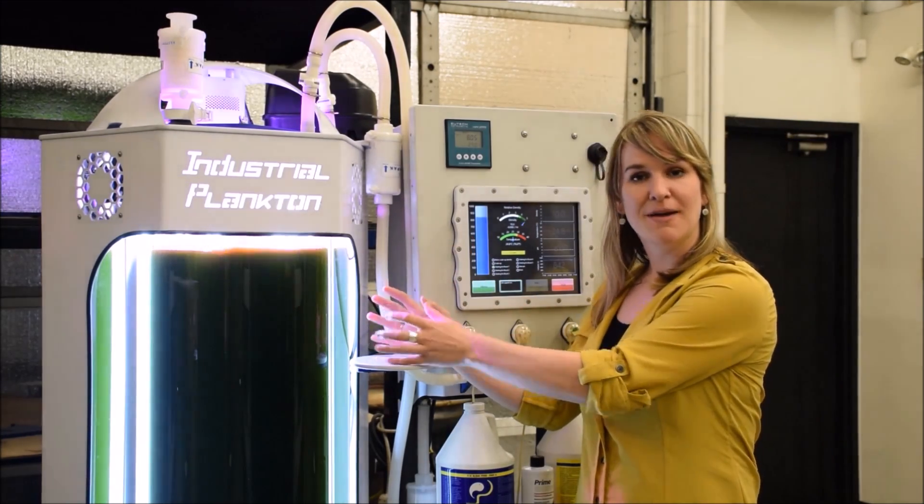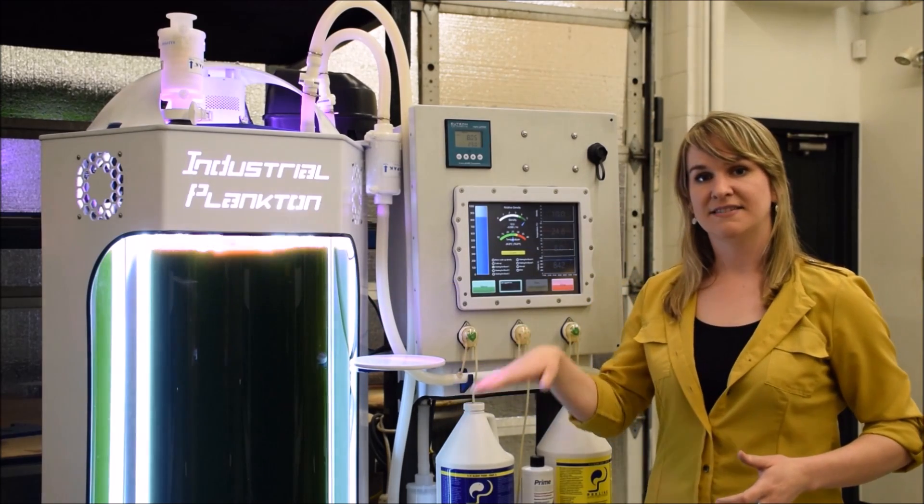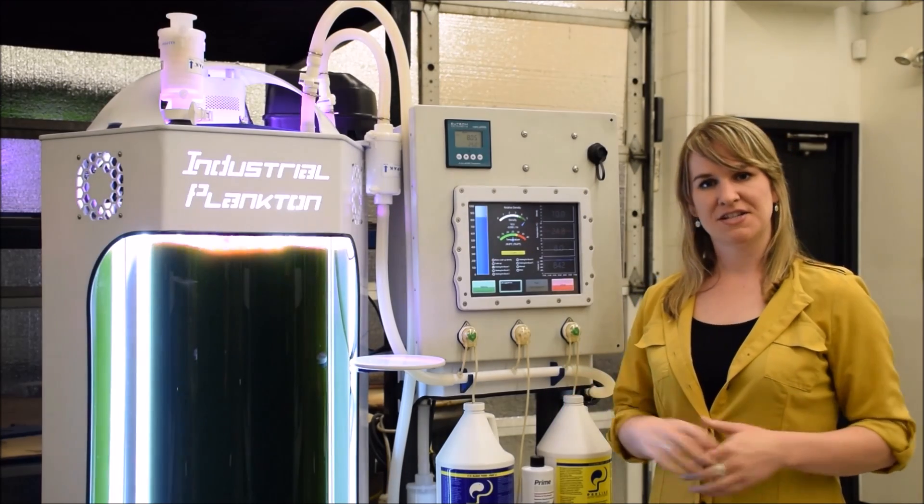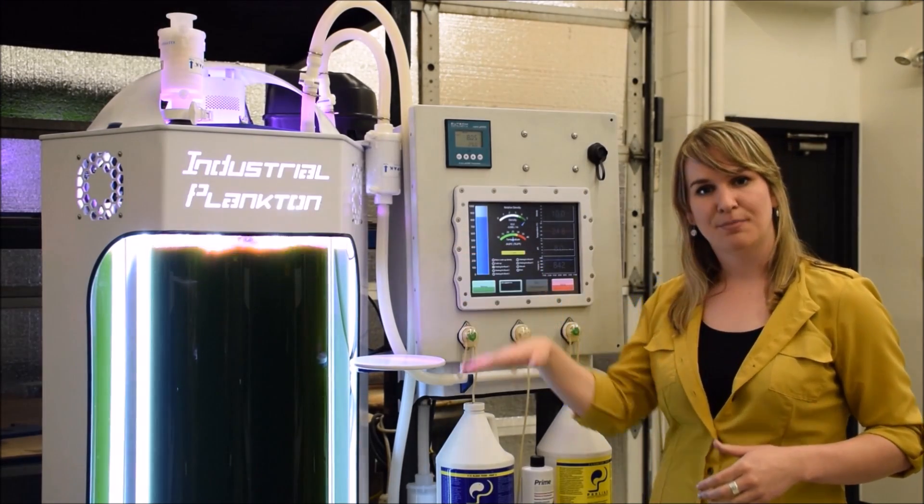If you inoculate with a small amount of algae, the unit will then scale up adding more water and nutrients to keep the culture growing. Once it reaches a set density, it will then harvest portions of that.